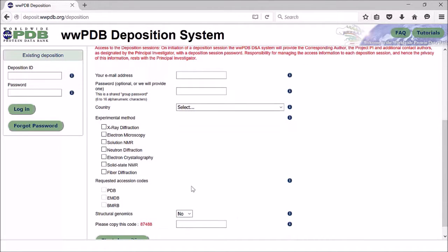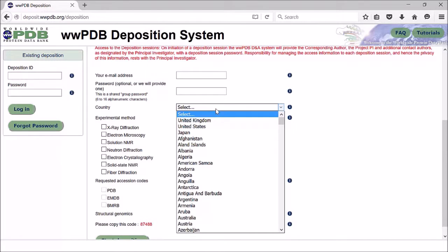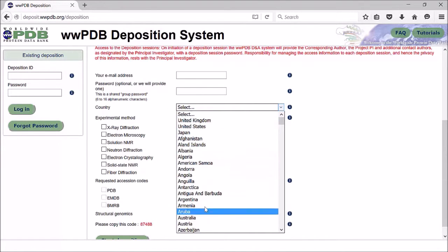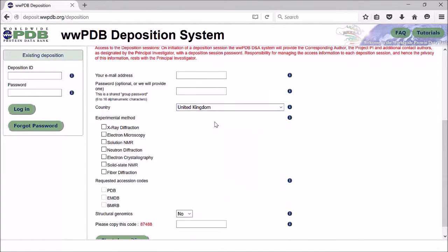The first thing you would do is select your country, where you are depositing the data from. This is because your data is dealt with by geography, so we at the PDBE would deal with the European entries and those from Africa.